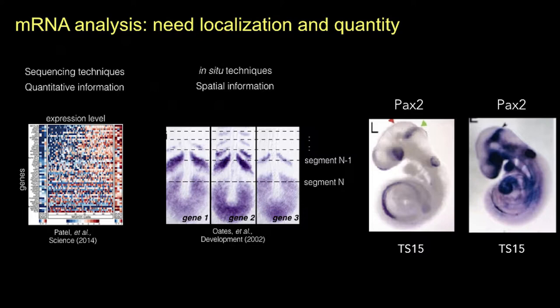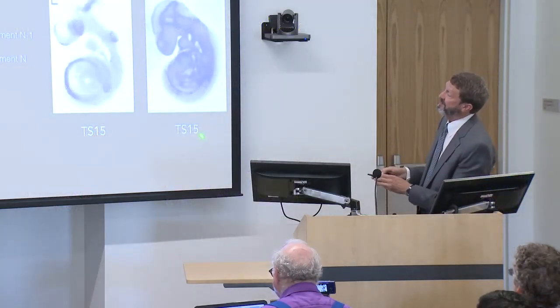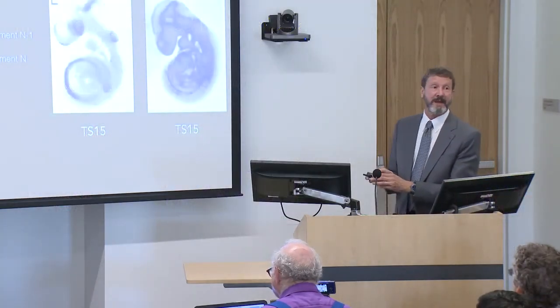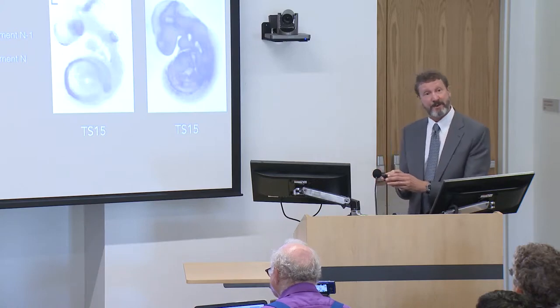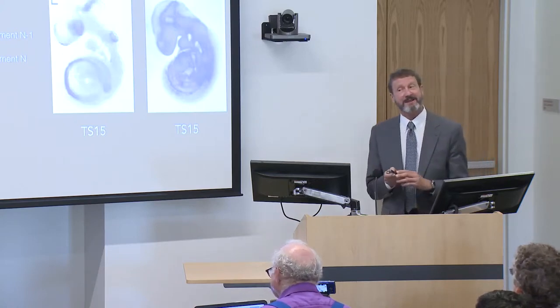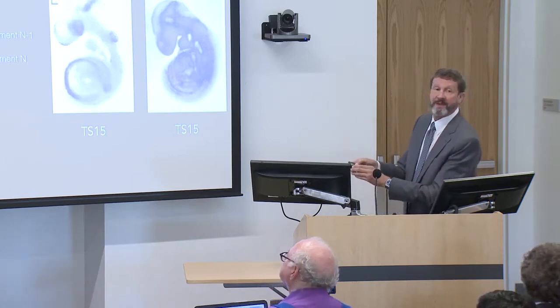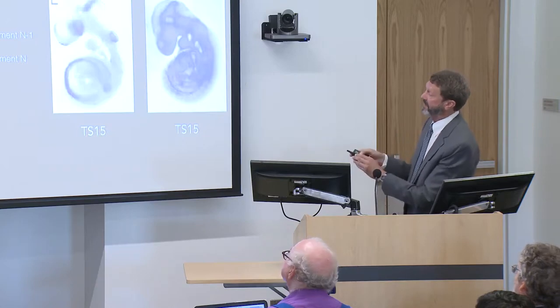Very few of us think about quantitative gene expression by looking at spatial transcriptomics, and that's because most of the tools are really flawed. This is the same gene at the same stage in the same strain of mouse and in the same paper. And it didn't bother the authors that those are so dramatically different. So if I want to ask quantitative questions that I can from a transcriptome and validate it, I'm in trouble.